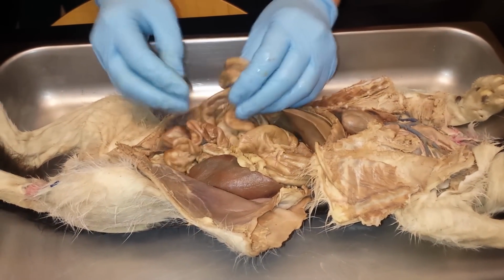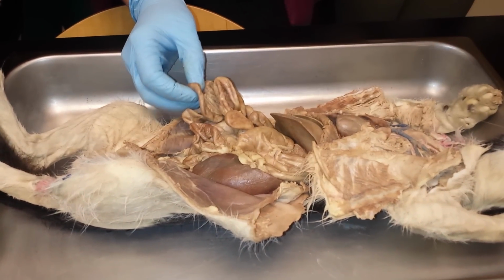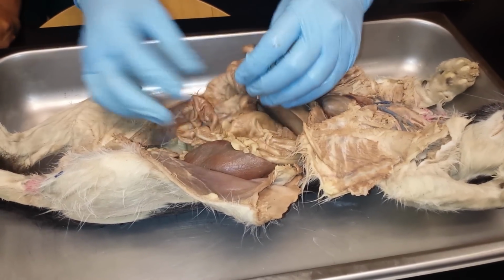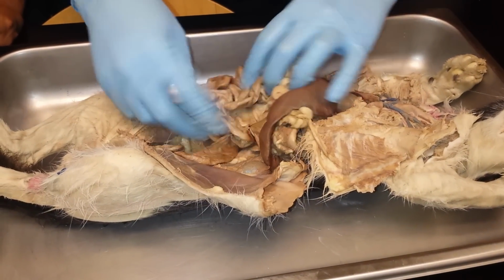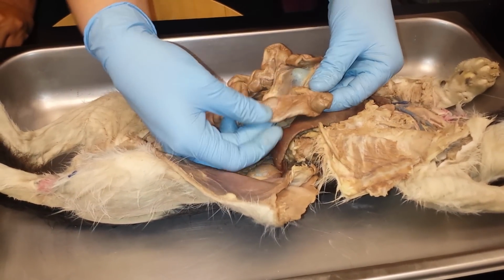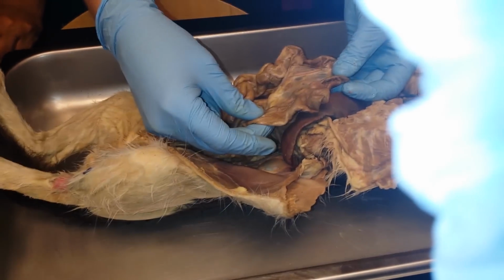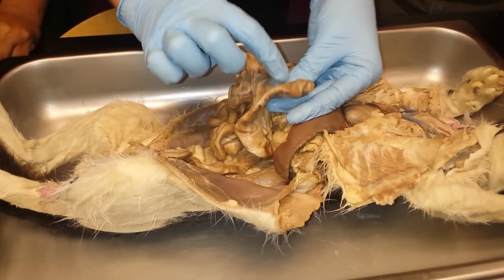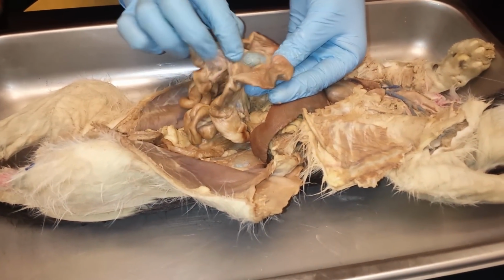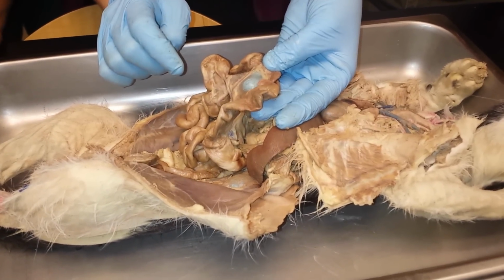So traveling along the small intestine, if I were to ask about an area of small intestine that's neither close to the stomach nor to the large intestine, you would say it's the jejunum, okay? So if you travel this around, let me look for this area. Okay, right here. Does everyone see that there's a size discrepancy between the size of this part of the intestine and this part? This is the small, this is the large, okay? So this area right here, this C-shaped area, this is the cecum. C for cecum. So if I ask about a part of the small intestine just before the cecum, it would be the ileum, okay?